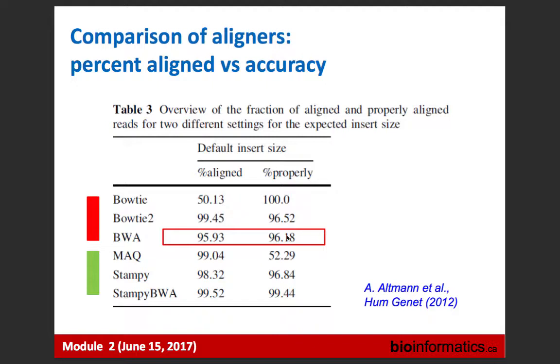How would we calculate the mean coverage? If you have 80%, so we have a FASTQ file with 20 million reads, let's say single-end reads. And we know that the read length is 75. And we know the length of the genome. We can calculate the mean coverage of the genome with our experiment, right? It will be the read length times the number of reads divided by the genome length. This will be the mean coverage.